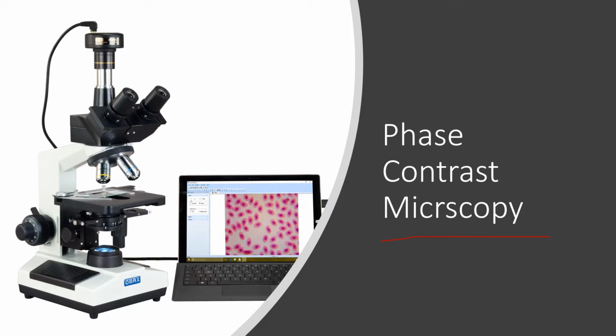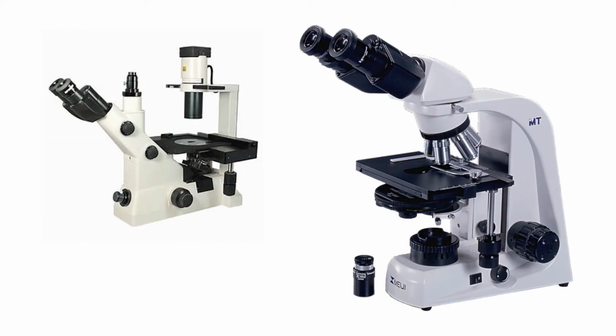See, like dark field microscopy, we have a laptop attached to it. But as you know, it is not always necessary to have a laptop attached to a microscope. We can also see through the ocular lenses. These are binocular lenses, through which we can see the image.